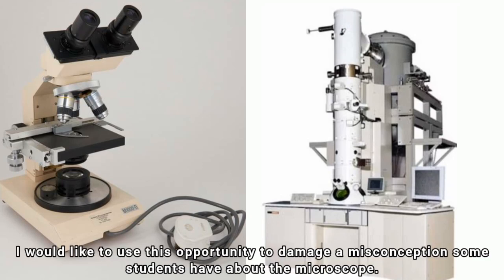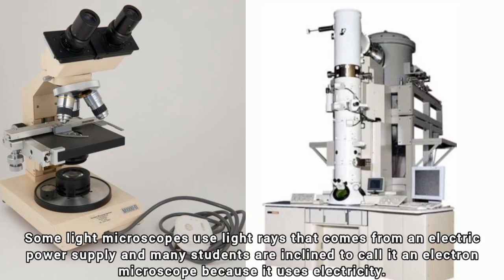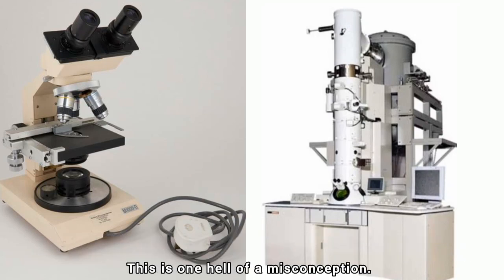I would like to use this opportunity to damage a misconception some students have about the microscope. Some light microscopes use light rays that come from an electric power supply, and many students are inclined to call it an electron microscope because it uses electricity. This is one hell of a misconception.